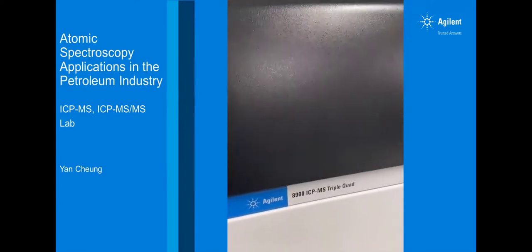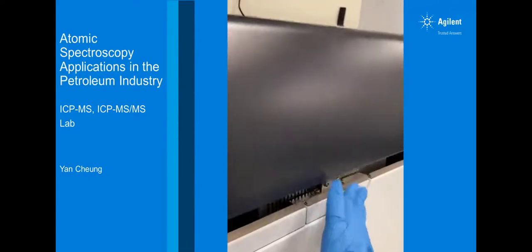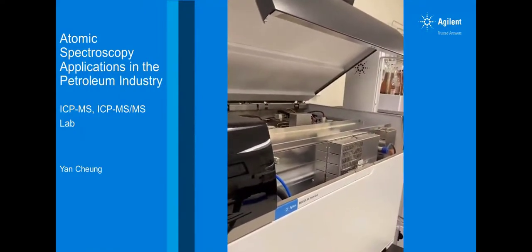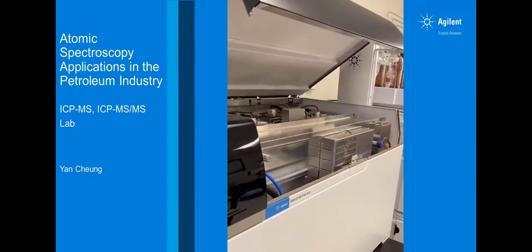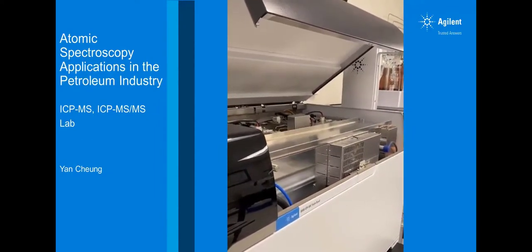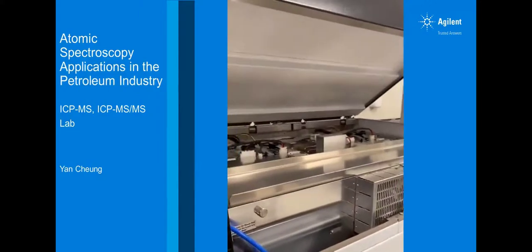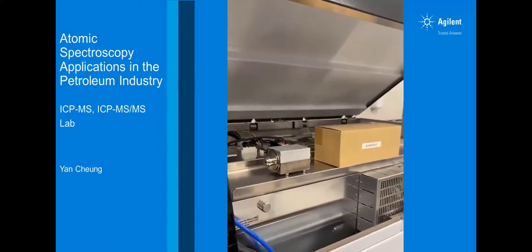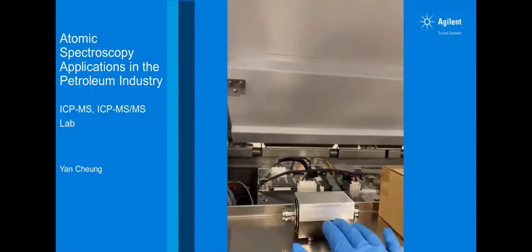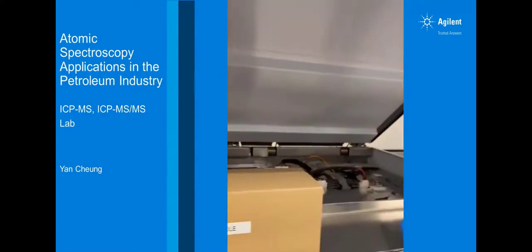Now let's take a look on the inside of the 8900 ICP-MS triple quad. By looking at the instrument, first you might notice it's a little longer than the single quad ICP-MS. That is because an extra quadrupole is being fitted in front of the collision reaction cell. In a single quad ICP-MS, after the extraction lens, there comes the collision reaction cell. After that will be the mass selector quadrupole, then is the detector.